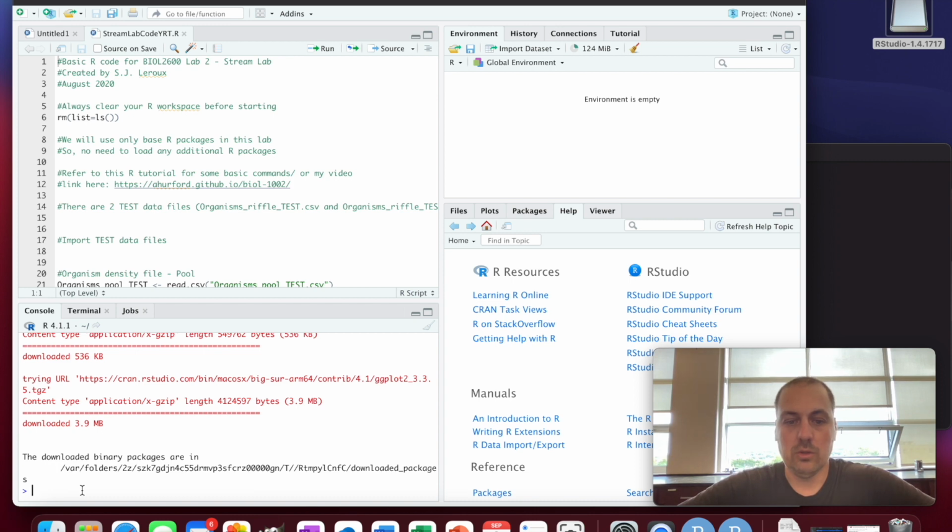So first thing we're going to do is make sure that we know where the files are. Now, before we even do that, this command right here clears everything. So if you get halfway through it and things don't start working, clear it, start over. It's one way to do it. Really, you should do that every time.